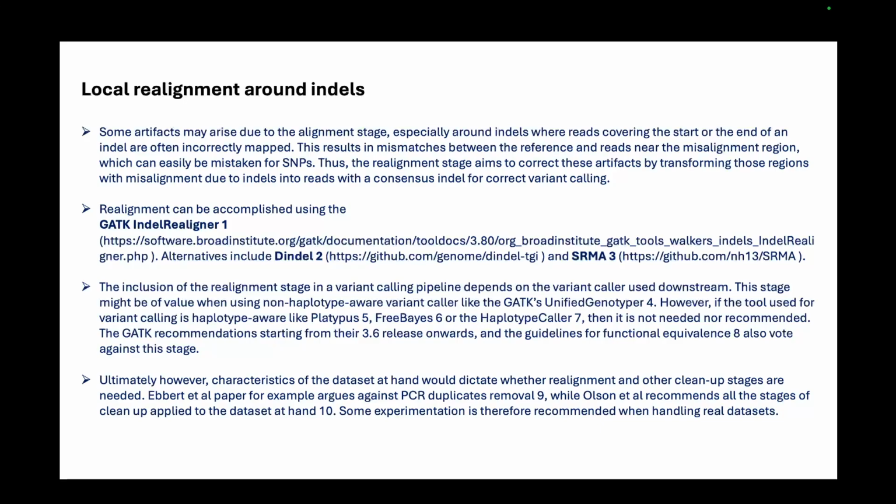So ultimately, the characteristics of the dataset at hand would dictate whether the realignment and other cleanup stages are needed or not. There are certain papers which argue against this PCR duplicate removal, and there are some papers which recommend all stages of cleanup to be applied to the dataset in hand. But there are conflicting reports on this.